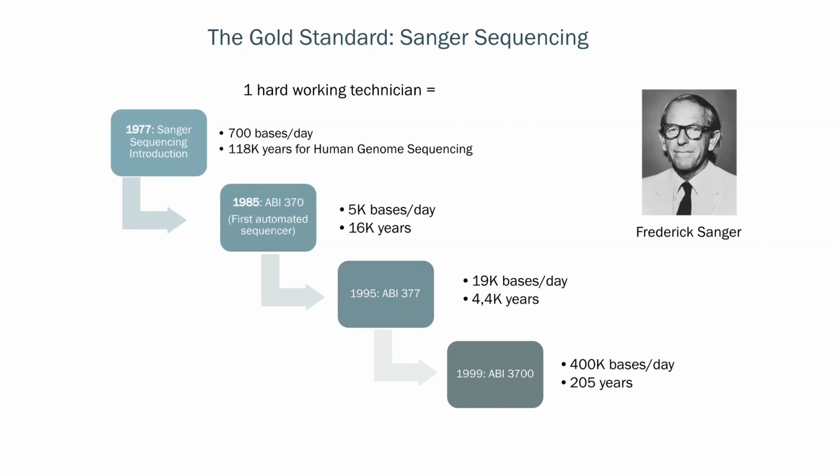We're going to be discussing the different types of chemistries that occur with Sanger. It would be impractical to Sanger confirm every type of variant, given the large number of primers, reactions, and interpretations that would be required. However, there may be instances where the veracity of a specific variant is in doubt. For example, called variants that are biologically implausible or otherwise suspected of being spurious.